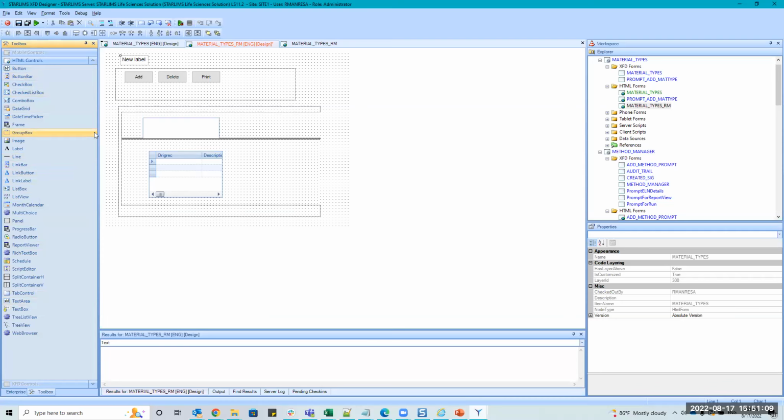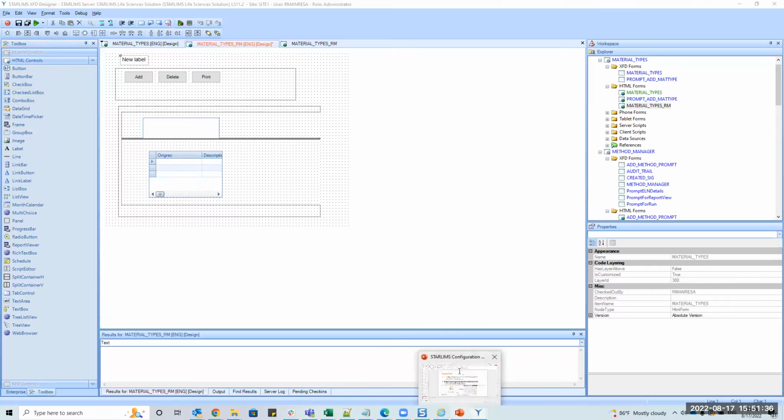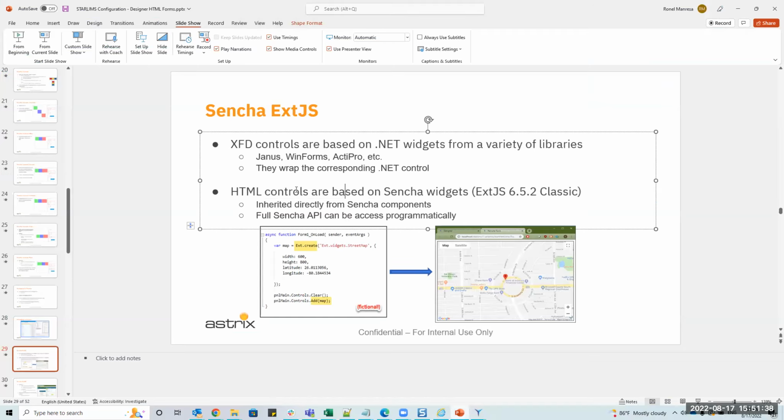If you need to go to Sencha to do some fancy stuff, it's nice for those hotshot developers who want to do a bunch of different things. But again, it's kind of overkill if you ask me. You have everything you need here. The whole app was written with these controls for the most part. Just because you have that ability doesn't mean we should. But anyways, it's here, so I mentioned it.